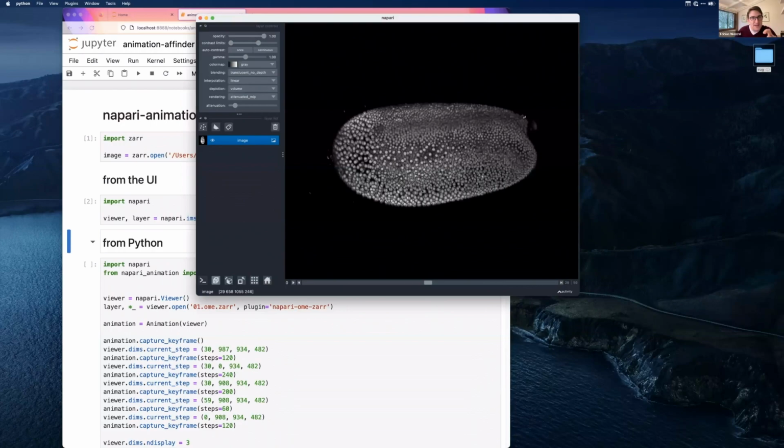So the menu is very small to see. So maybe if you just share that window or make it a bit bigger, is that possible to zoom in? It is not possible to make the menu bigger, but I will just say what I made.